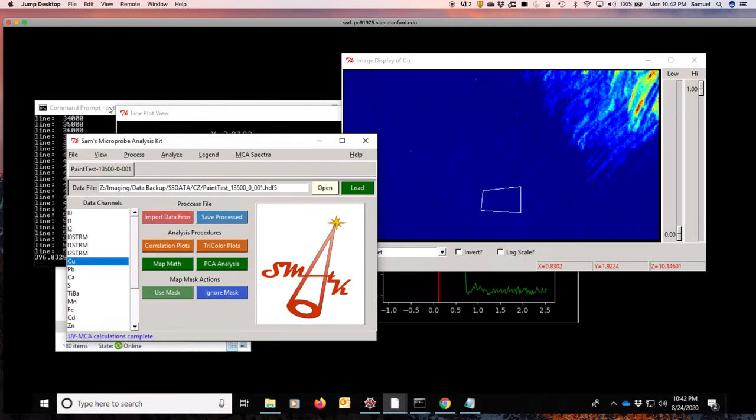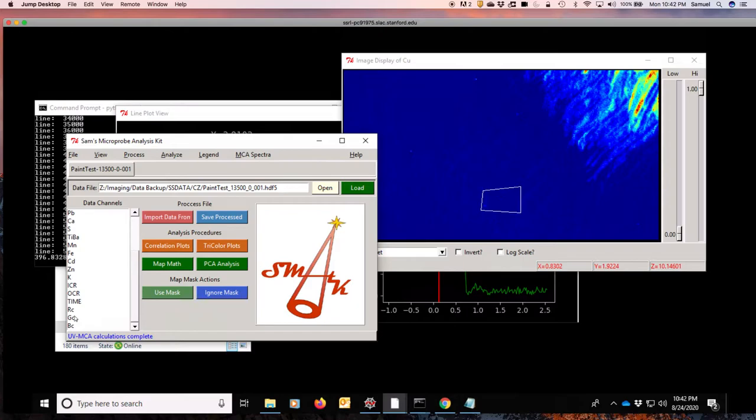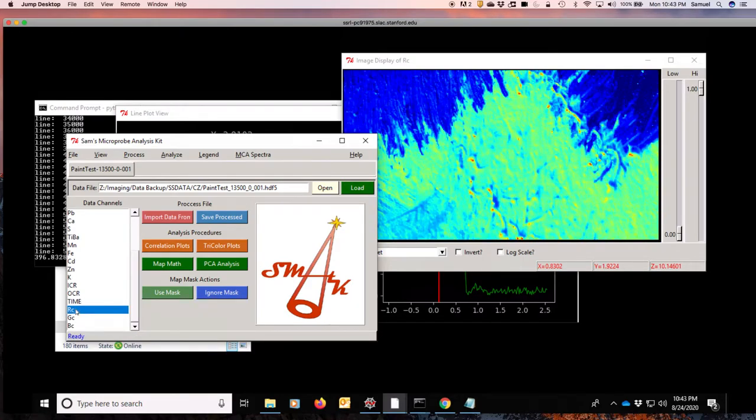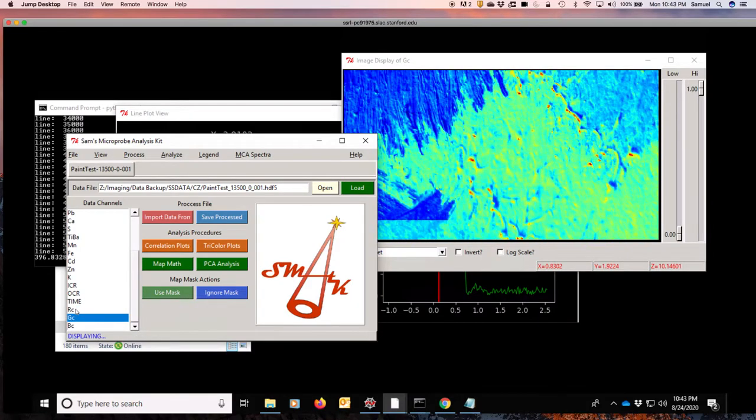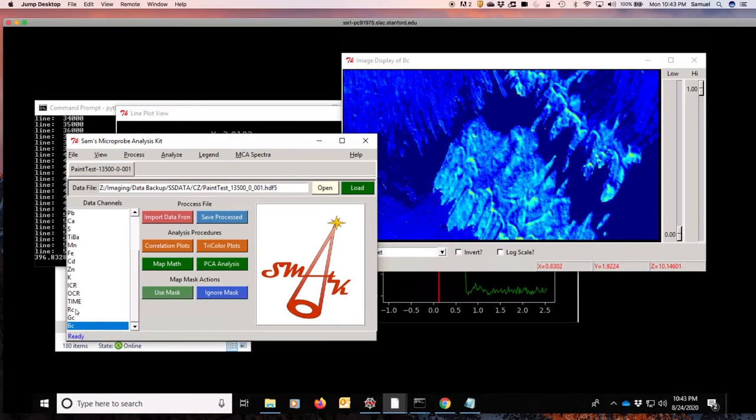Okay, so some time has passed now, and the calculations are now complete. We can scroll down and see that we have now channels for the red, green, and blue parts of the spectrum.